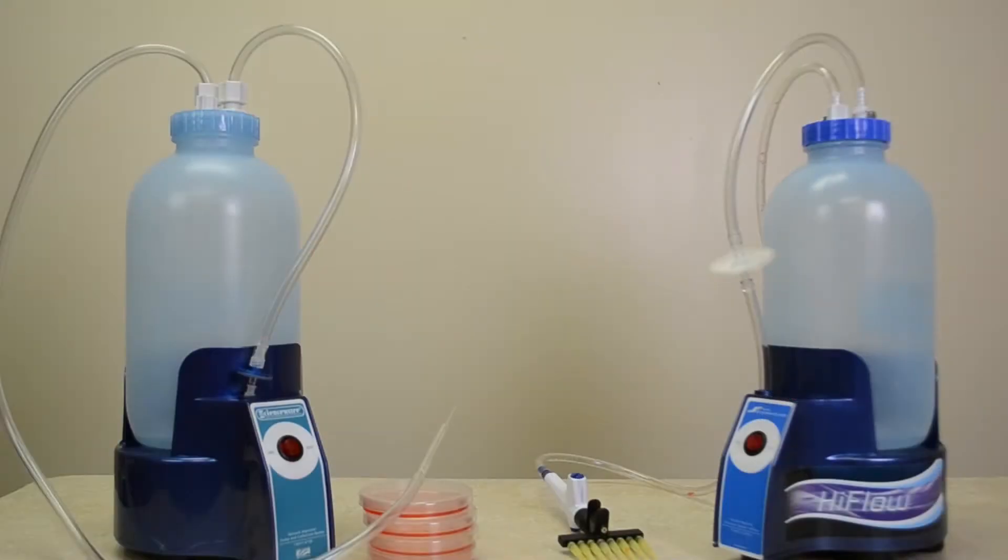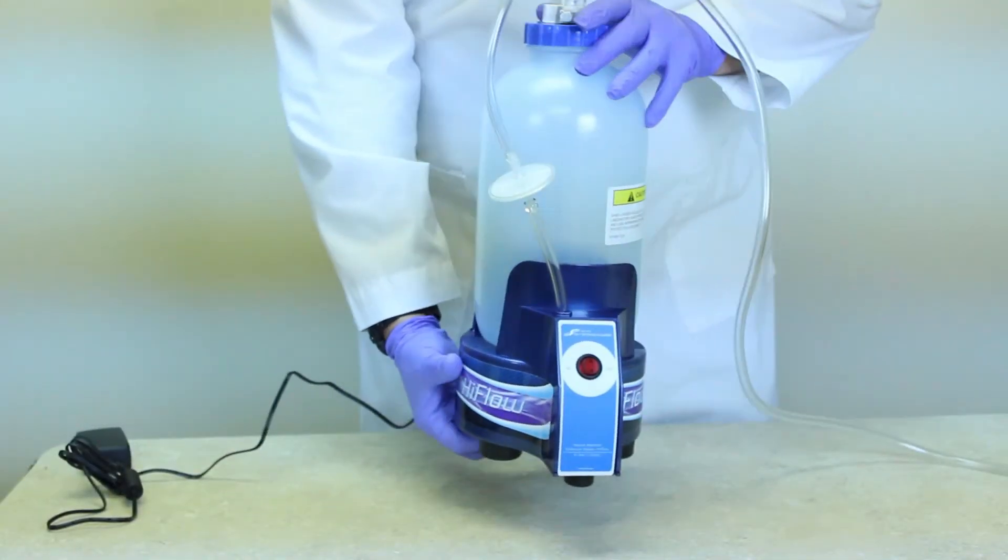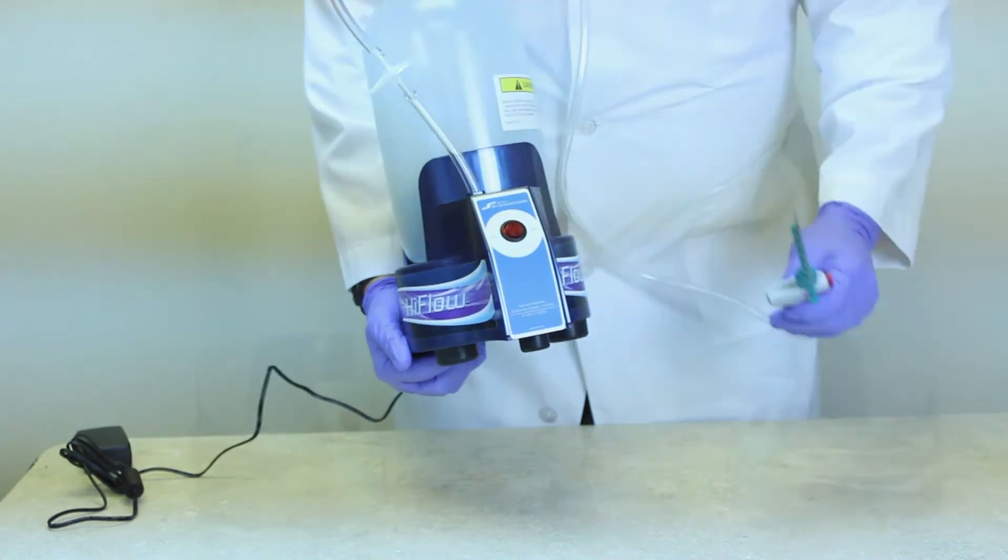These self-contained systems include a built-in maintenance-free pump so they don't require an external vacuum system. That, along with their compact size, makes them portable for use anywhere in the lab.